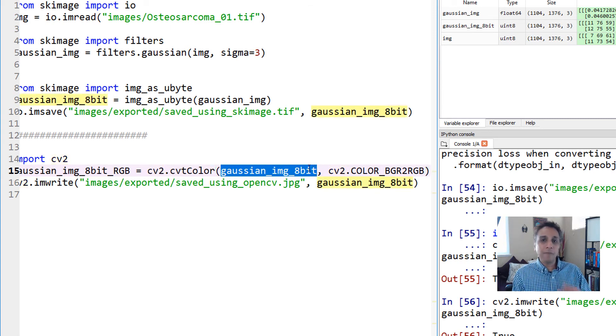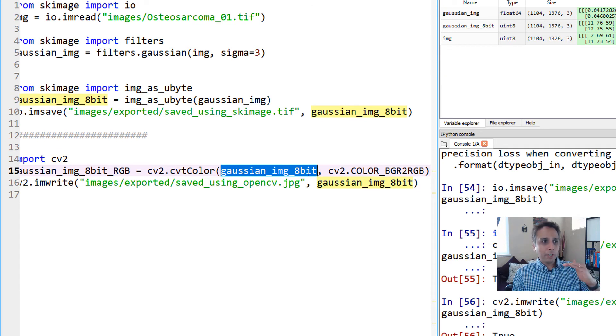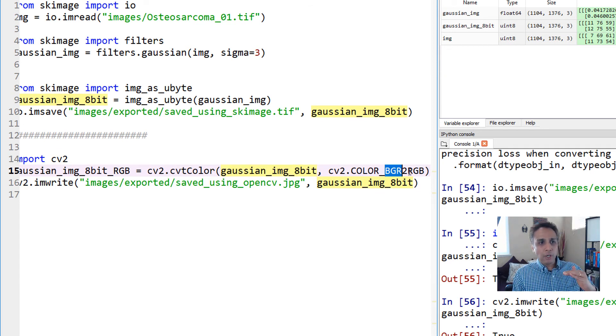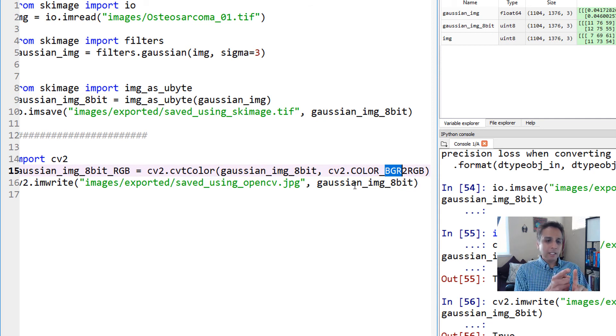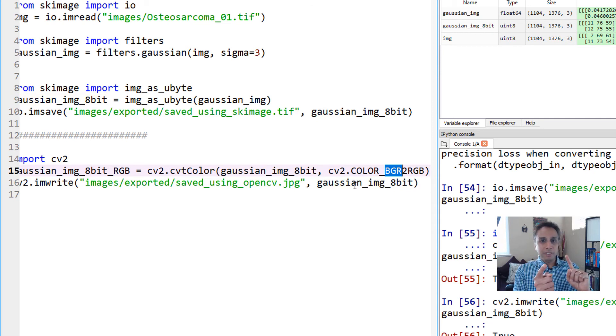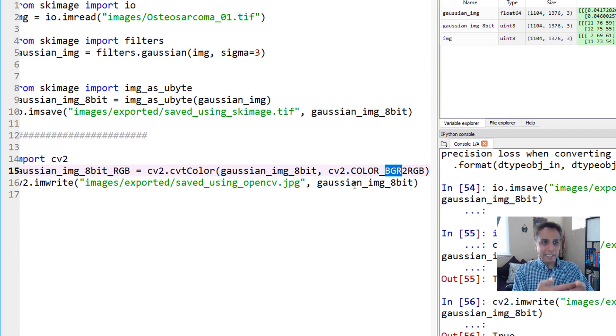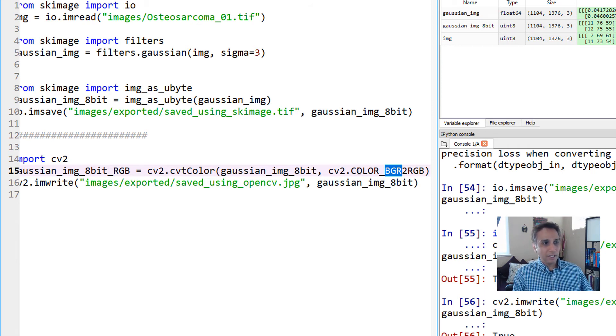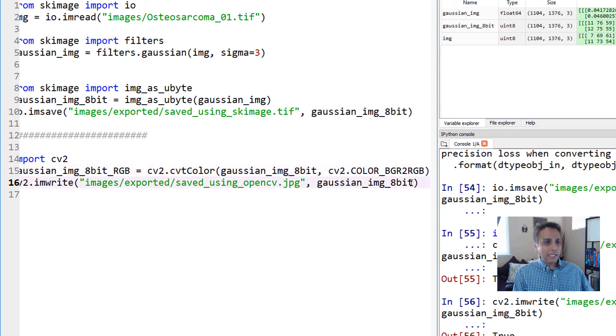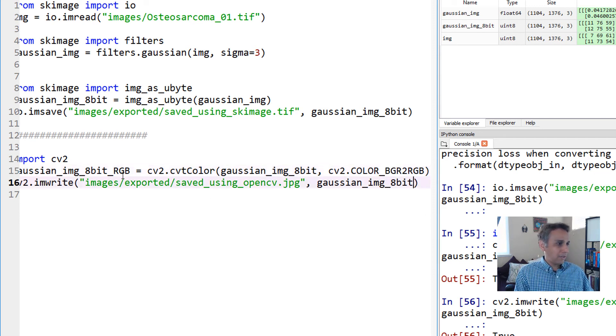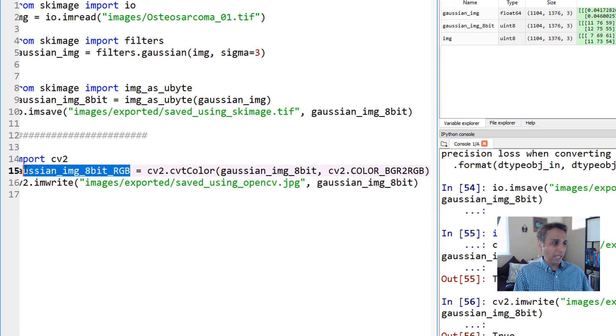I'm going to use cv2.cvtColor which is part of OpenCV, and convert this 8-bit array from BGR into RGB. All it's doing in the backend is moving B from R space to B space and getting it into the right order. Then I'll save that new array, gaussian_img_8bit_RGB.